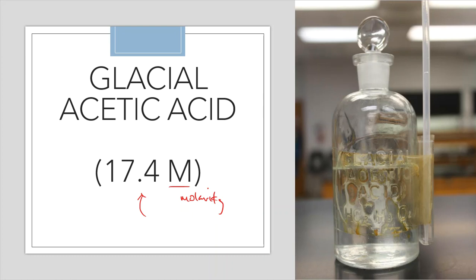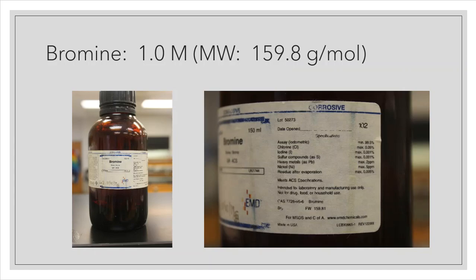All right, well, this is stuff that I don't want to sniff, I don't want to inhale, and I'm going to maybe prep this under the fume hoods because of that reason. I don't want the odors, I don't want the stench that comes around with glacial acetic acid. Think of Easter on steroids. Easter, eggs, coloring, a lot of times vinegar is going to be used for that purpose. It is just a soured, awful smell that fills the lab up, and I ain't having it today. So I'm going to go to the fume hood to prep this solution.